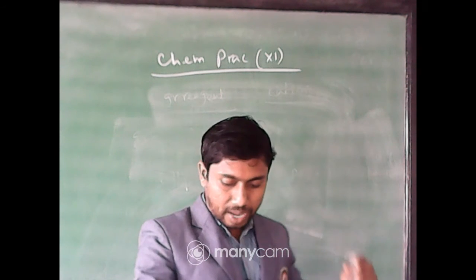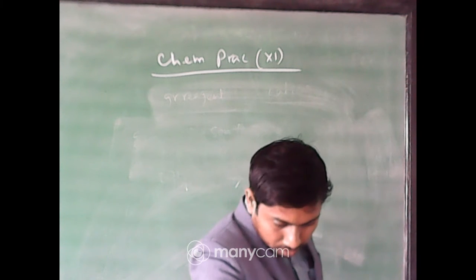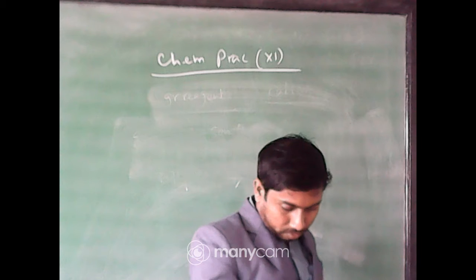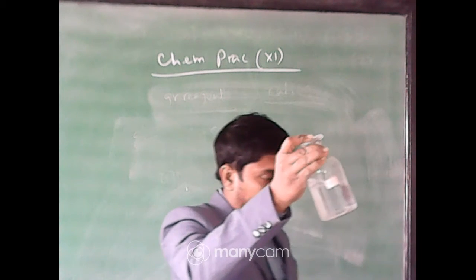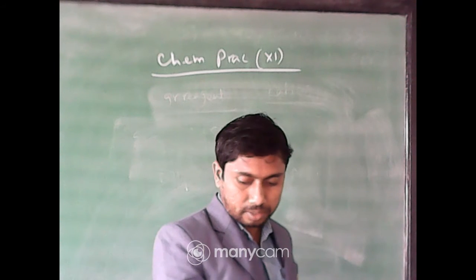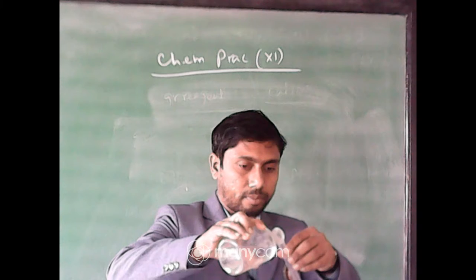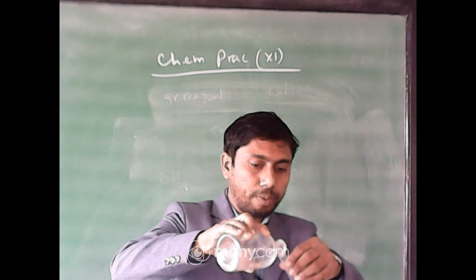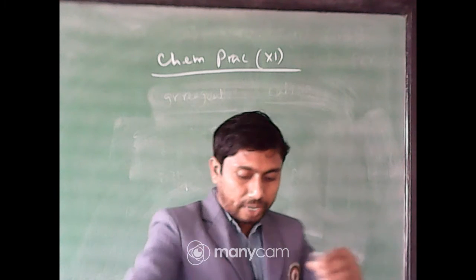At first we will add NH4Cl. This is the NH4Cl, clear and transparent. Now, no PPT will be there, it is just the effect of the common ion.